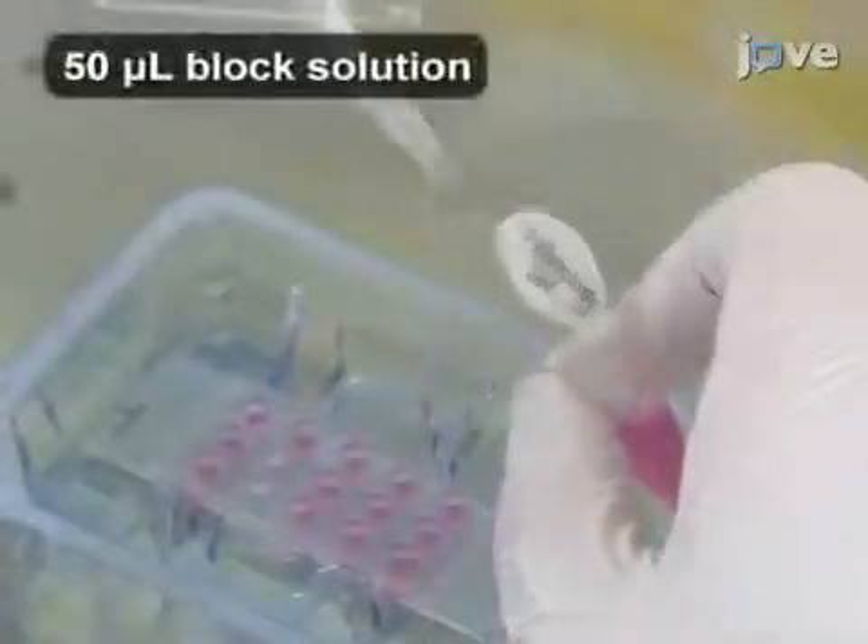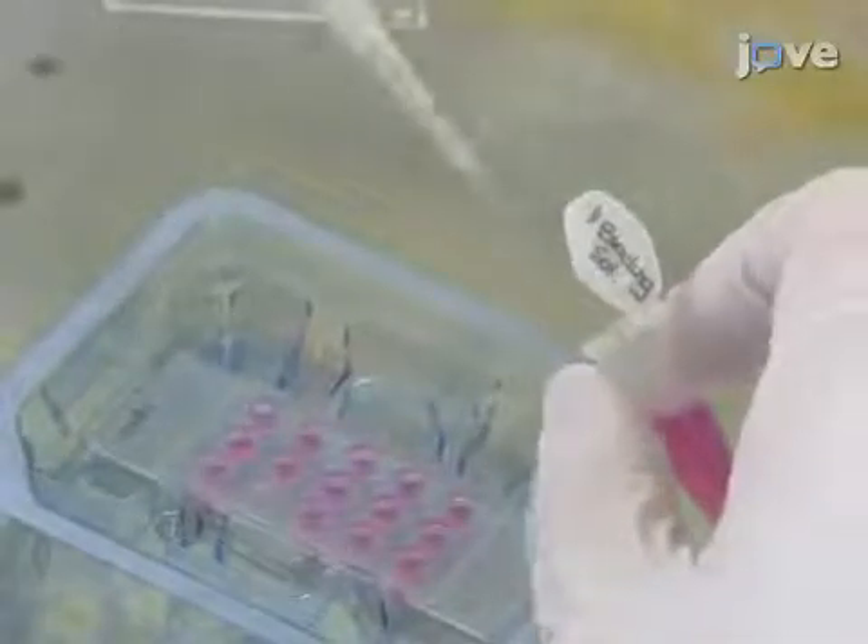Apply 50 µL of block solution to each well, then incubate the plate for at least 30 minutes until they are needed. Allantoic explants are very sticky, so the block step is critical for the success of the protocol.